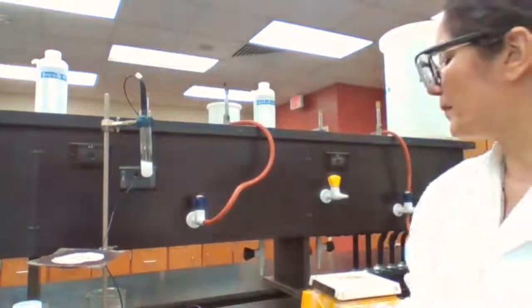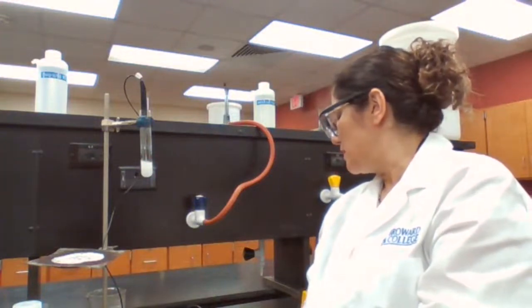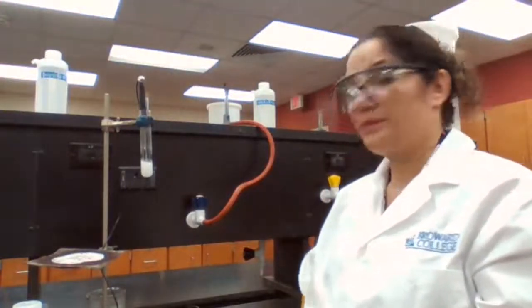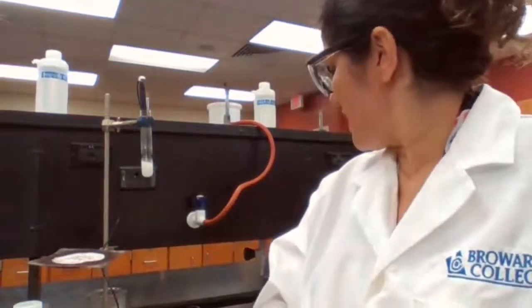Okay. Freezing point of solution is 45.8 degrees Celsius.